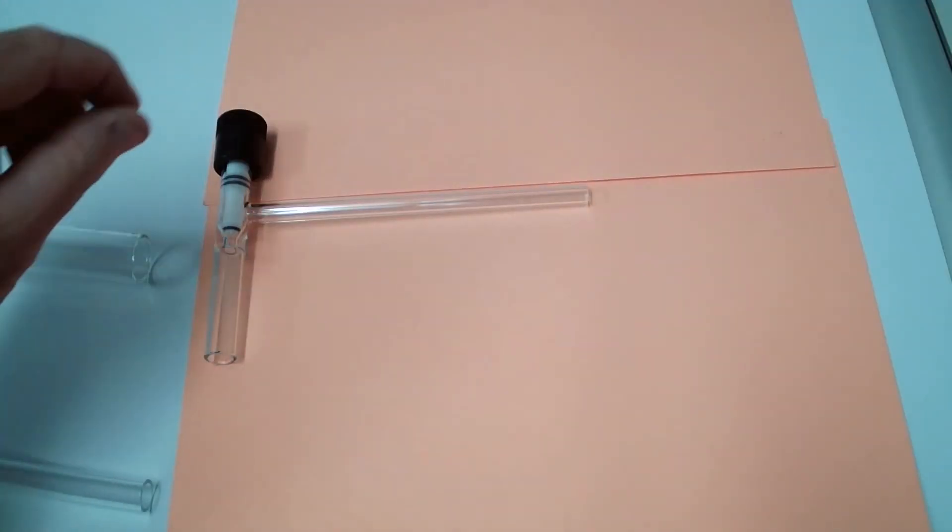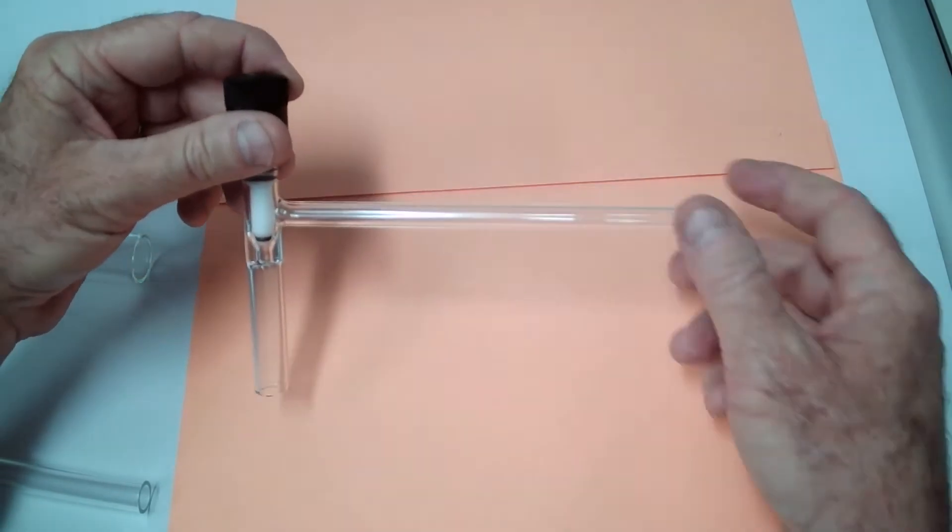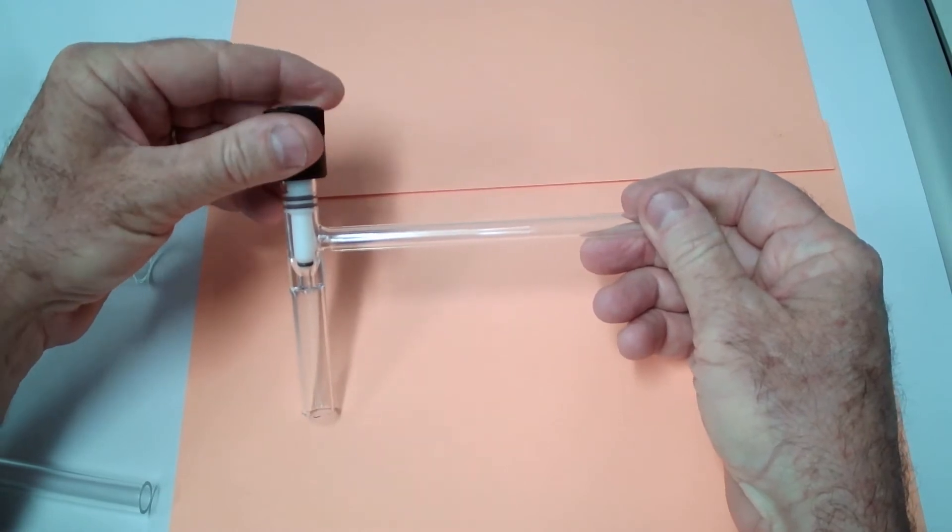When you are looking to purchase or designing glassware using high vacuum valves, they will come in different sizes.